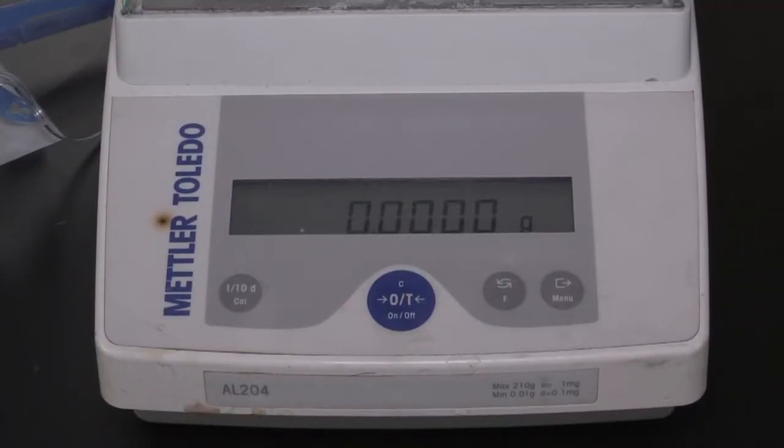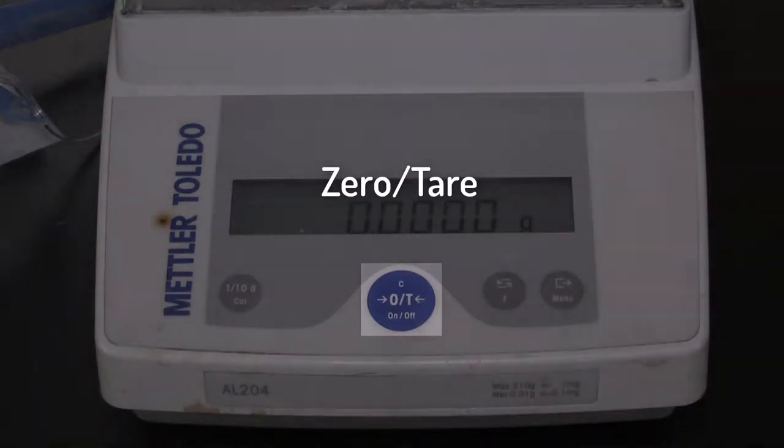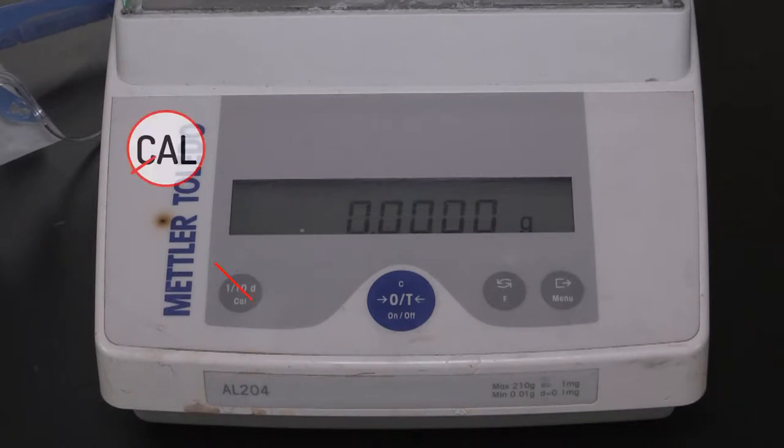Let's take a few moments to identify some of the buttons on the balance. First, there is the zero tare button. This is the one that you're going to use the most often. Don't ever touch the calibration button and also make sure that the correct units are being measured. The units should be grams.